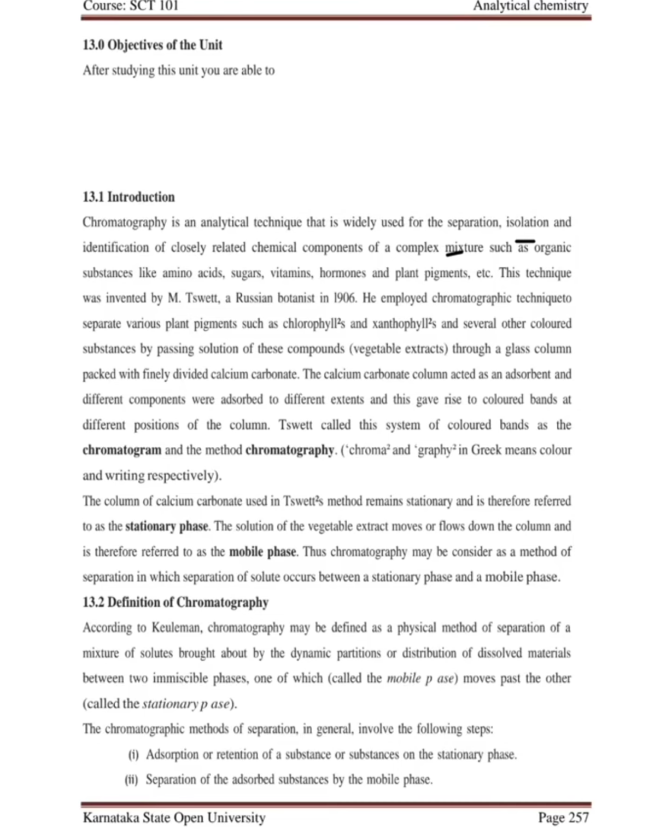If there is a mixture of components to separate, you use chromatography. It is used for separation of amino acids, sugars, vitamins, hormones, plant pigments, phytoconstituents, and organic synthesized compounds. If you get byproducts, we are going to separate them using a chromatographic technique.